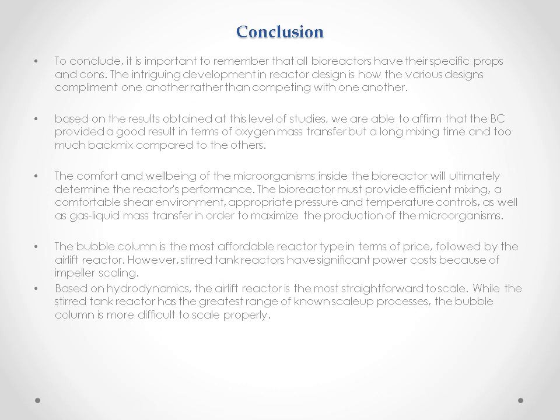To conclude our presentation, at this level of study, we can say that bioreactors complement one another since every bioreactor has its own pros and cons. From the obtained results, we notice that the bubble column bioreactor performed very well in terms of oxygen mass transfer. But the problem with the bubble column is that it has a long mixing time and too much backmixing when scaling it up. The other advantage of the bubble column bioreactor is that it is the most affordable on the market, followed by the airlift reactor. But the stirred tank bioreactor has high power costs associated with impeller scaling.